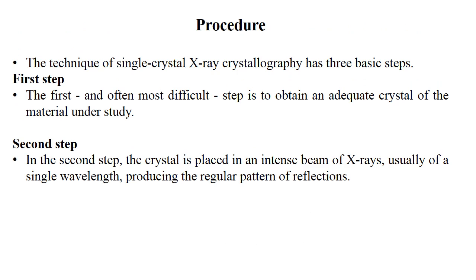Procedure. The technique of single crystal X-ray crystallography has three basic steps. The first step, and often the most difficult step, is to obtain an adequate crystal of the material under study.